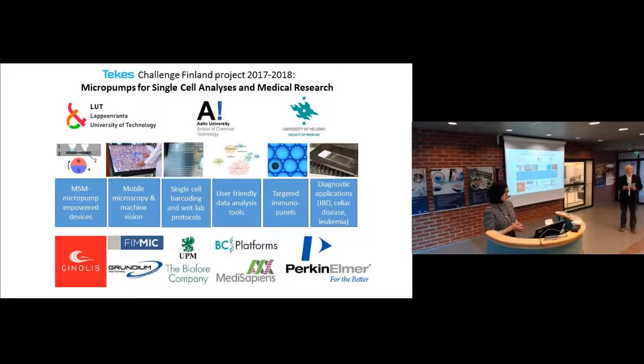Well, most of those, I mean, those capillary electrophoresis stuff, we just buy the kits and we just run them and we use them as such. We don't really innovate anything new to those commercial platforms. But for example, in the single cell field, we have lots of ideas to how to improve that, making it cheaper, making it better, and how to build better chips to capture certain cells only, for example.